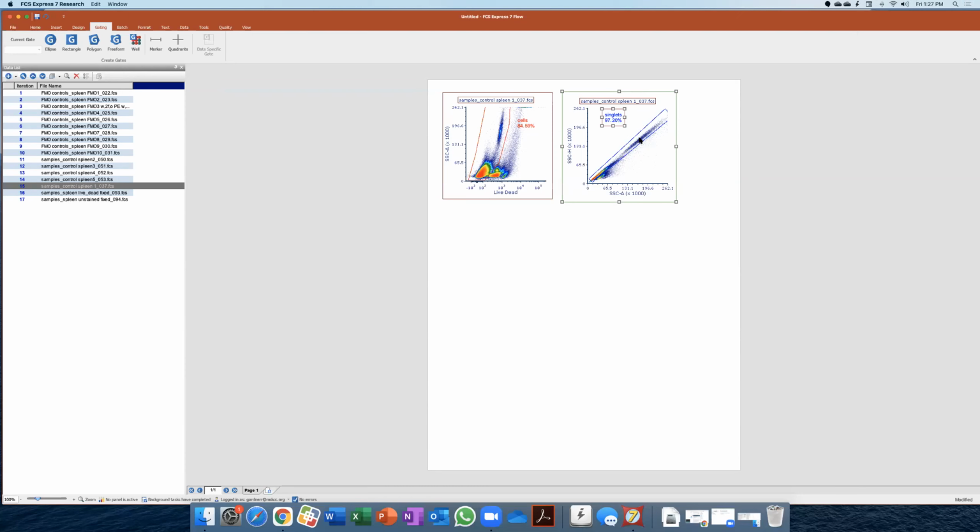Rui, is it okay if I ask a question actually? Yes, sorry. Okay, no, it's okay. So I have a quick question for you. You're talking about the activation and the ability to pull out single cells and how it might change based on activation status. For me, that brings up the point that different samples might need slightly different gating. So does FCS Express allow you to have sample specific gating, or does that same gate apply to all the samples? Yes, it does.